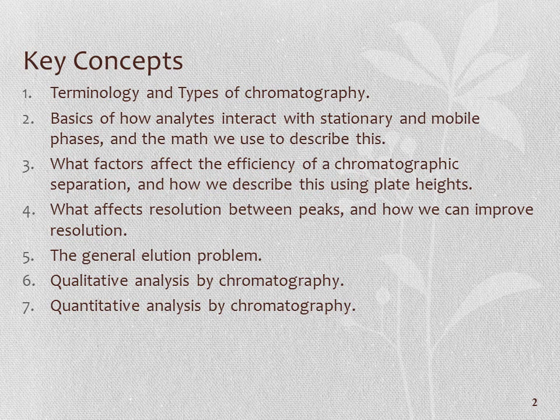With these fundamentals comes the concept of what a plate height is to describe the efficiency of separation, and also what the resolution between two peaks is. Finally, I'll wrap up with a few comments about the general elution problem and about how we can do qualitative and quantitative analysis using chromatography.